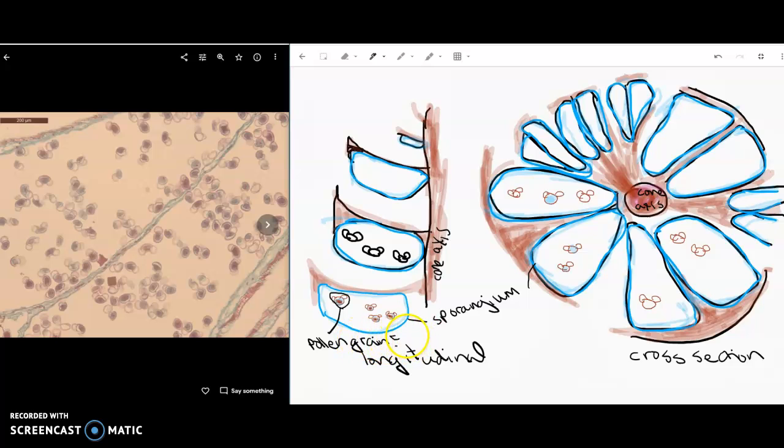And at this stage, it's considered an immature microgametophyte. And then these things coming off, that is the micro, because we're talking about the male cone, sporophyll, and over here you can see evidence of the microsporophyll as well.